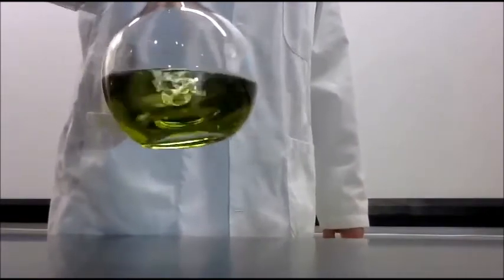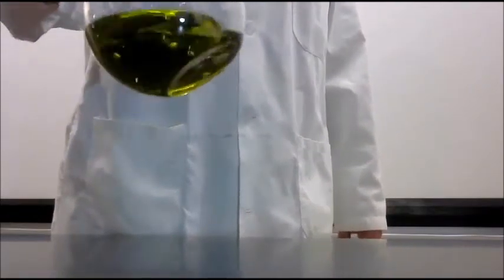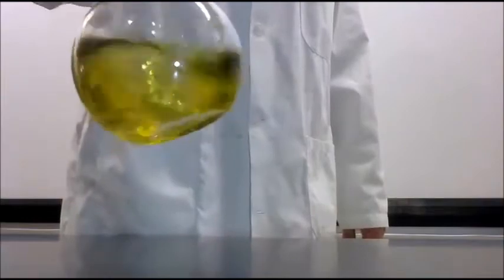It's gone from blue to green, now to kind of a yellowish green. And now we've got a yellow solution.